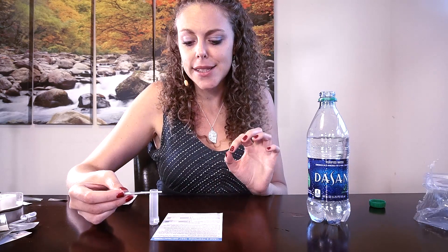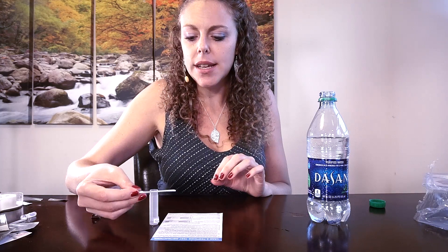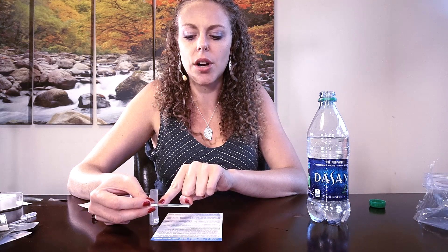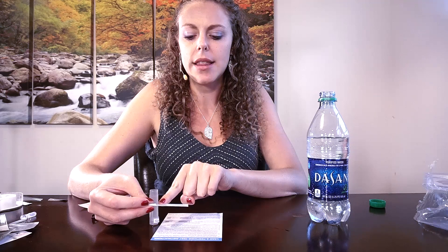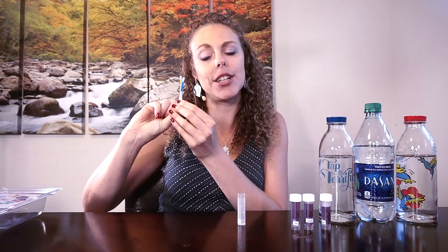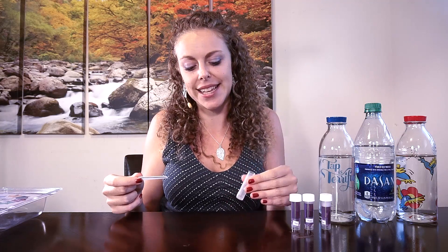Our results are now ready for the lead and pesticide tests on the tap water. On both strips, the line on the left closer to the one is significantly darker than the line on the right, so these are both testing negative for pesticides and lead — a really good sign. Looking at the lead and pesticide levels in the Dasani water sample, once again both tests are negative. The line closest to the one is significantly darker than the line closest to the two, so no lead or pesticides in that bottled water either.